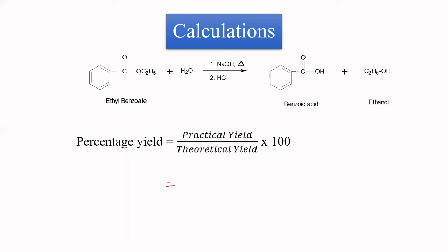This is the criteria for the selection of solvent. तो हमारे लैब में अगर तुम देखोगे तो अलग अलग solvents available है. Simply हम पहले start करते हैं water से. We check the solubility in water.